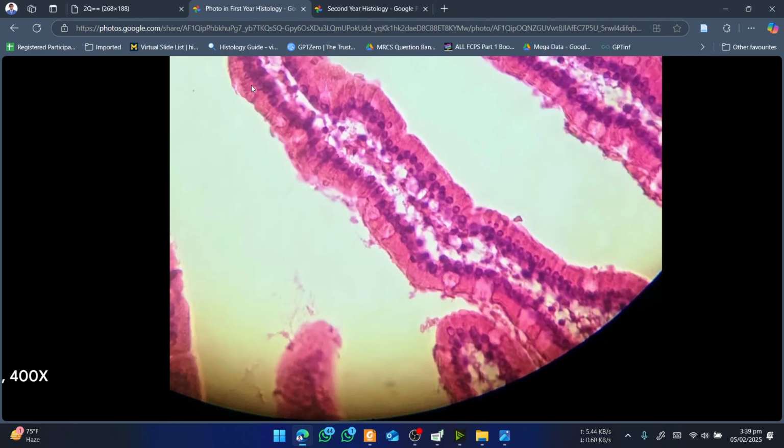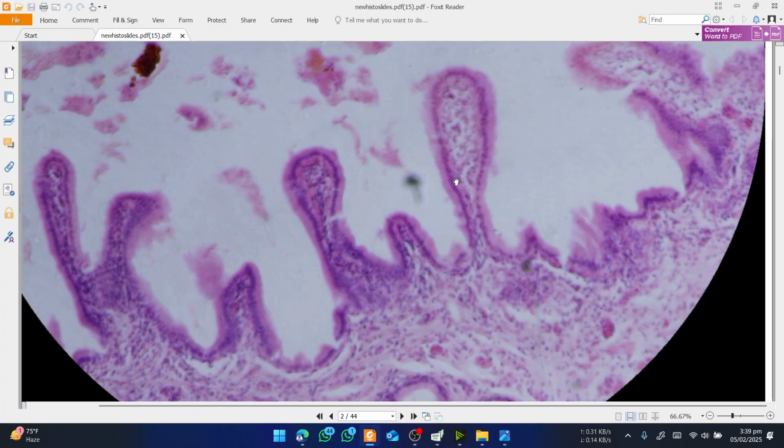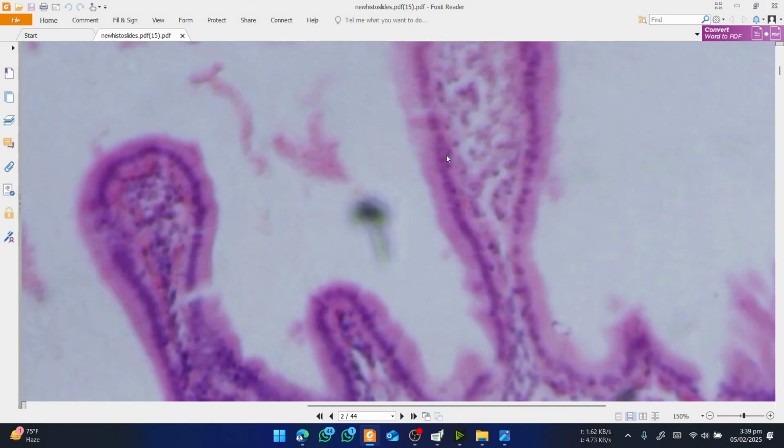In this picture you will see the same thing. Here, due to zoom restriction, you may not be able to identify it, but here you can very clearly see the nuclei in the same line. That's a very clear thing that is visible, and then this is one cell, and this is one cell, and so on. Okay, moving on.